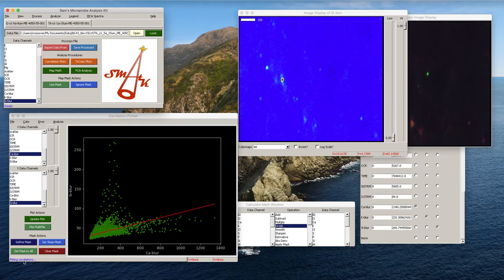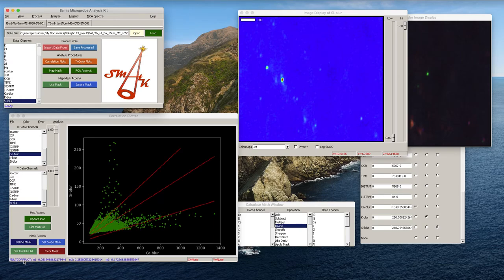It's fitting the correlations. Okay, and those are the 3 regression lines that it came up with, so, you know, maybe not such a good job, but if I try fitting maybe 1 or 2 more regression lines, I might be able to get a better fit through here or a better fit through here. It really depends on the correlation, how well this analysis works. The slopes of these lines are given down at the bottom of the plot here, so you can see the M1, M2, and M3 slopes that it predicted.